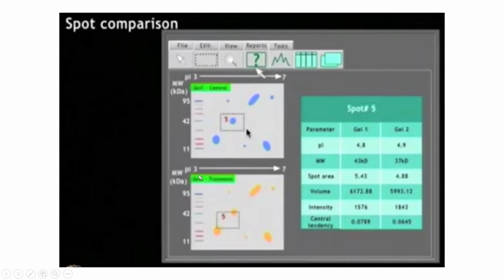So this is the first dimension running, although it is blurred, I'm just explaining, from pH 3 to pH 7 they have used. So proteins are run here initially, then after that it is placed on SDS-PAGE and your ladder is added and it is separated, right? In the vertical direction. So here you can see in gel one, the PI was 4.8, then the PI was 4.9 because, if you can see, it is slightly towards the right-hand side, the yellow one.